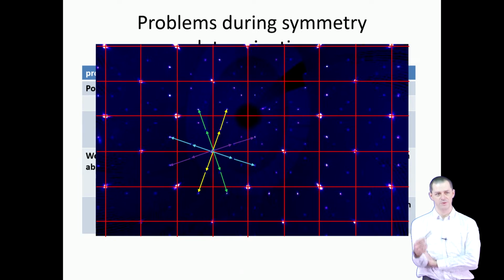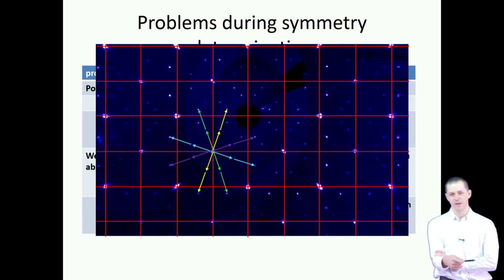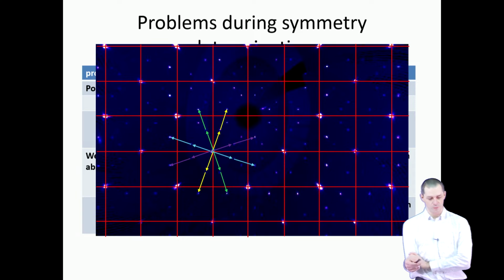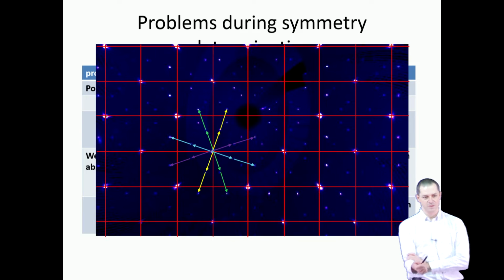You'll probably spend 2-3 days looking at the pictures and having a feeling you'll never figure this out, but you will, and the next one will be better, and then after a couple of years you will just look at it and see it immediately in half a minute. So just be patient and don't give up.